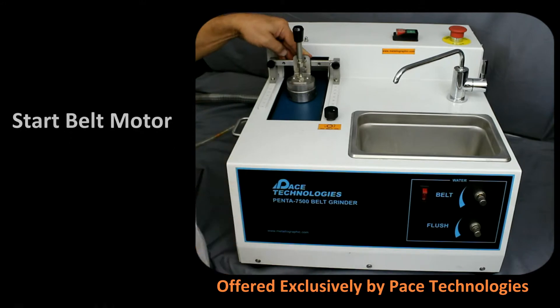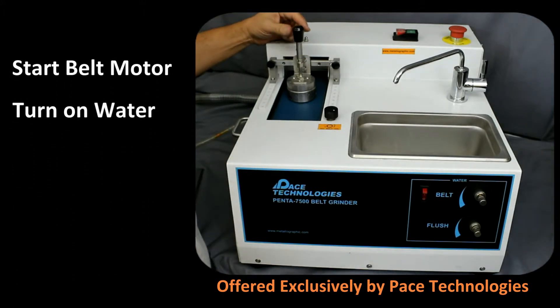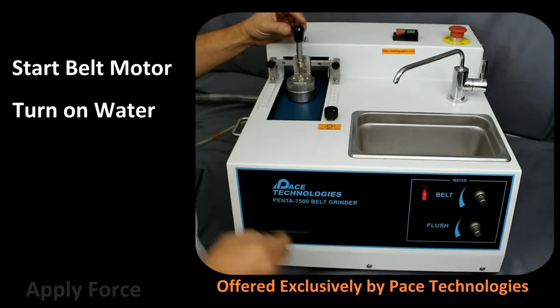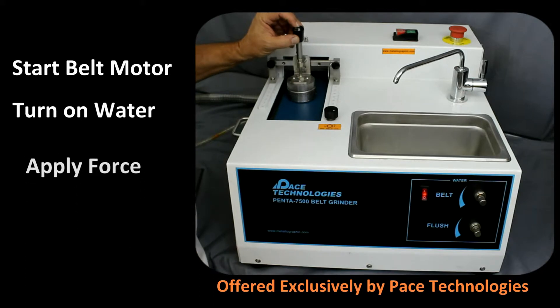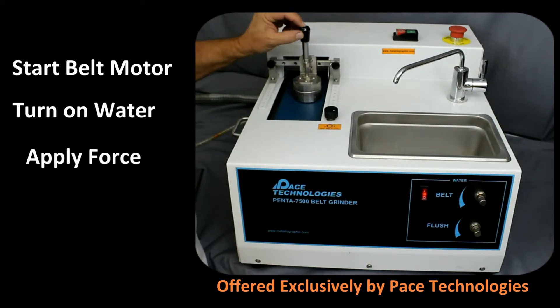Start the belt grinder and water flow. Position the sample on the belt and apply the force through the loading shaft. Although the tracking of the sample on the belt can be moved, it would be better to hold it in place for each grind for better control.